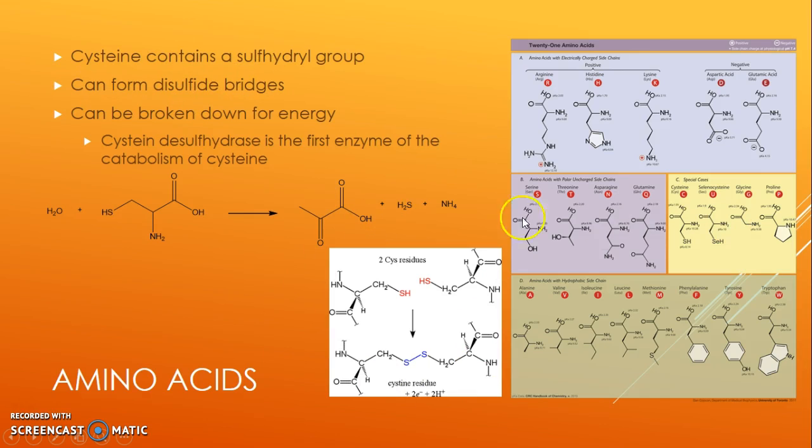All right, so hold on, let's take a look at this real quick. This is cysteine, the amino acid cysteine right here. So I'm not lying to you, right? It's got the SH right there. Got the carboxylic acid. Got the amine group, right? And then the SH right here. And it's got a carbon right there too.